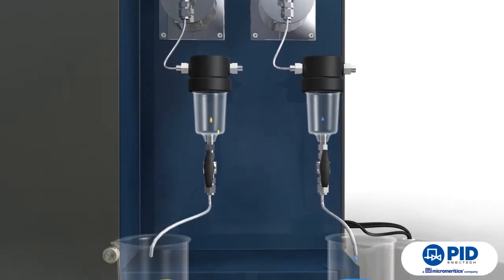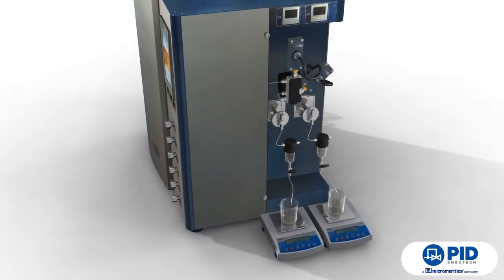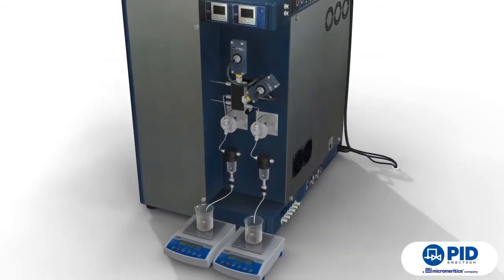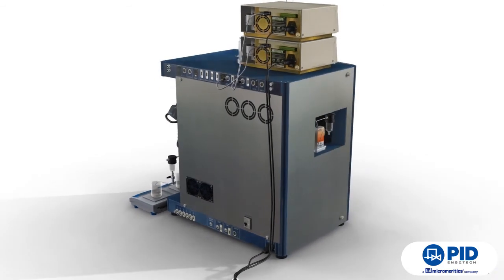These actuated valves are micrometric type valves with high performance and rangeability, enabling drainage of every new drop of liquid and maintaining the level in the separator with high precision.